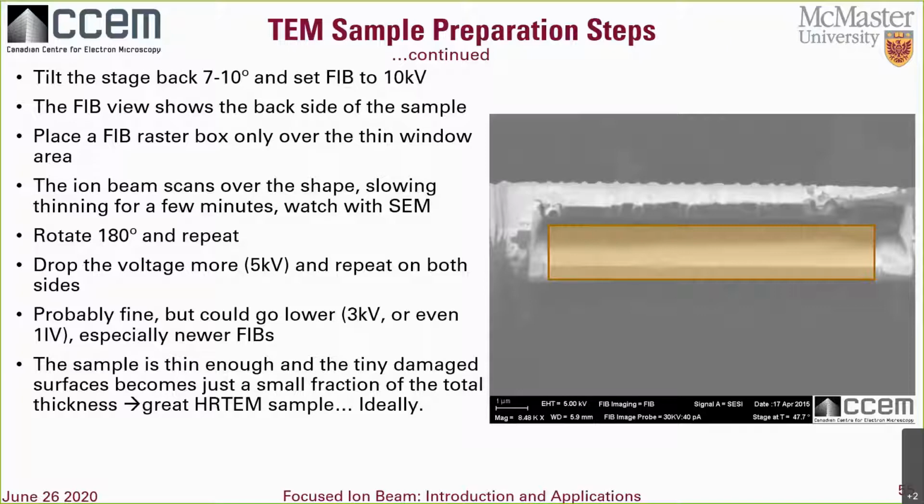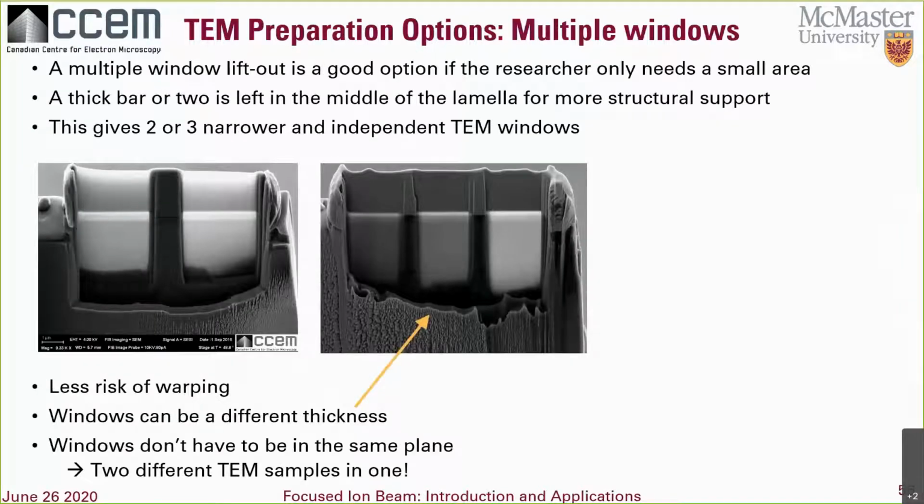Things can still go horribly wrong at this step, and you can wreck a sample right at the end if it starts to warp too much and forms rapidly growing holes. So good luck. Next, I'll present some options for TEM liftouts.